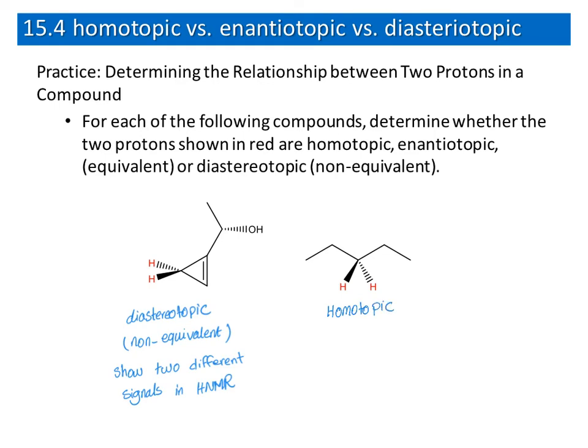Homotopic protons are equivalent, and they show one signal in hydrogen NMR.